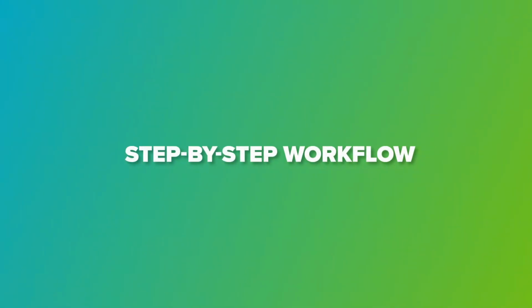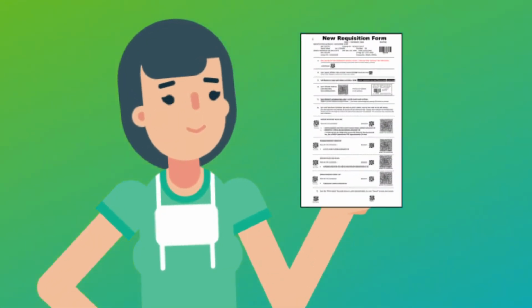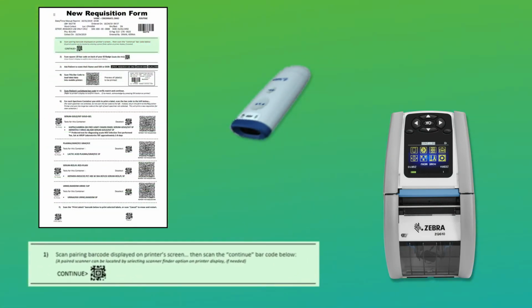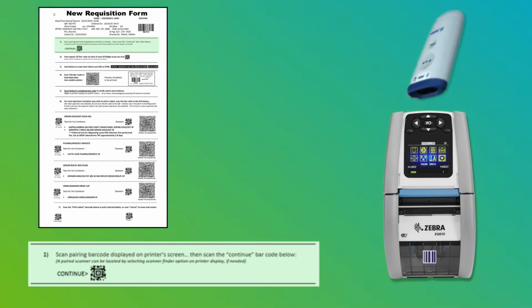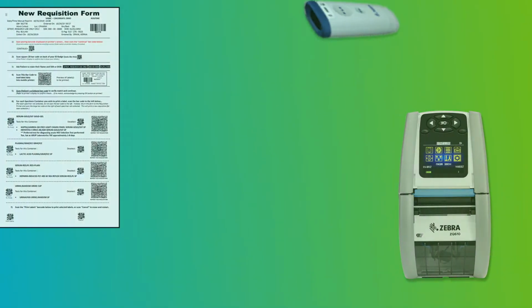Now, let's look at how the form guides the workflow step by step. This form guides the clinician or health tech through the workflow and is also an excellent training aid. Step 1 is to confirm that the barcode scanner is paired with the Zebra mobile printer. Then, scan the Continue barcode on the form to proceed to the next step. If it is not already paired, you simply scan the pairing barcode on the printer, and then scan the Continue barcode on the form to proceed to the next step.